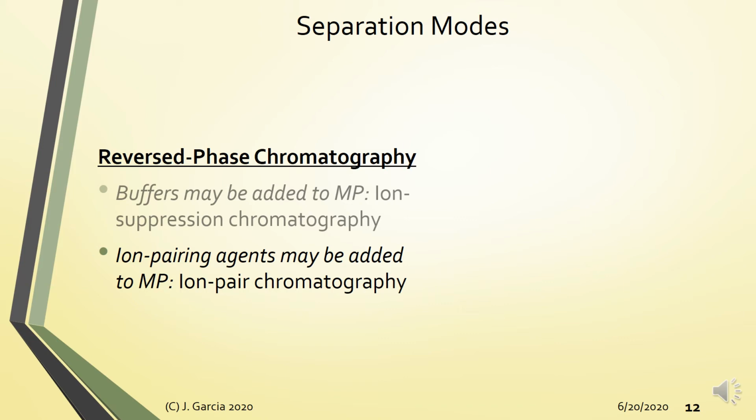Alright. So next, you have what you call your ion pair chromatography. So this is another technique that can be used for your ionizable compound. Alright. So say you have a molecule that is positively charged. Okay. So as we mentioned earlier, for reverse phase chromatography, charged molecules will tend to be more attracted towards the mobile phase. So there will be lower retention time or faster elution for charged species. So one way to control their, or to retard, no? I mean, when you say you want to retard the elution, it means to say that you want to increase the retention time for that particular molecule.